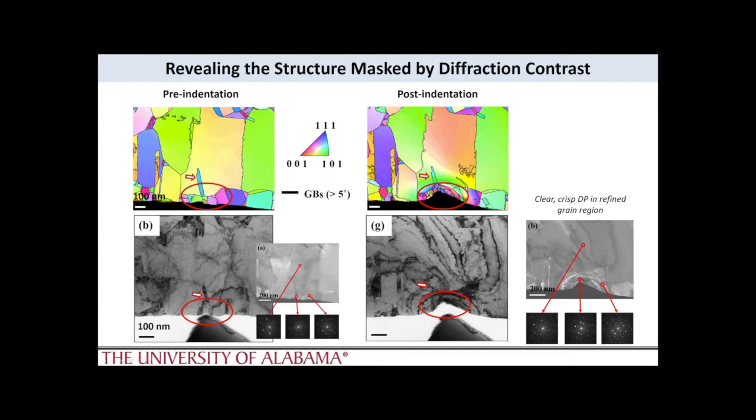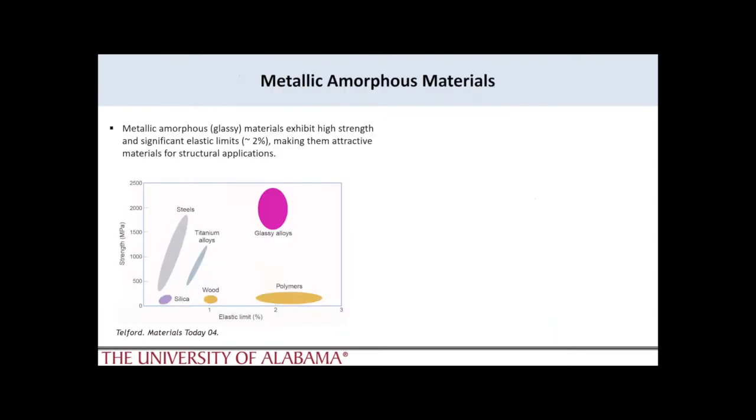And the other advantage is that you might say, well, maybe these are artifacts, because these are always issues in bright field imaging with these types of experiments. Maybe the foil's bent and we're seeing one pattern on another. But by having the individual diffraction patterns as we serially scan this area, we're able to distinctly see very clear, crisp patterns, indicating that these are really grains and not an artifact. And so I really think this picture brings together what PD can do in your use of cross-correlative microscopy techniques, in this case, in situ deformation.